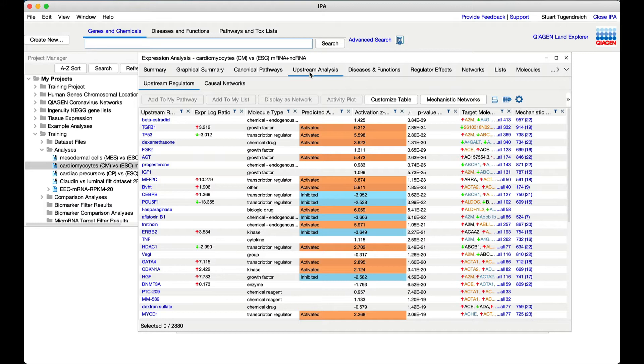Let's filter to upstream regulators that are genes, RNAs, or proteins by using the funnel in the molecule type column.